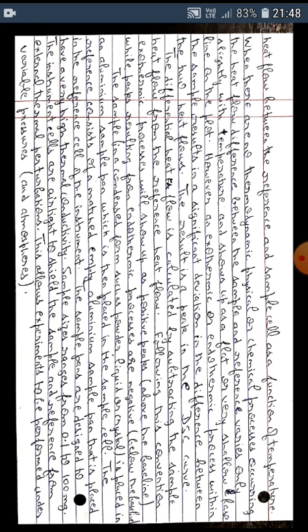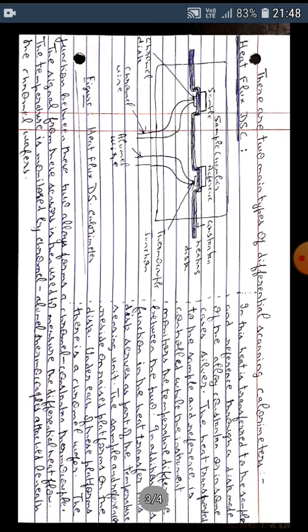The instrument cells are airtight to shield the sample and reference from external thermal perturbations. This allows the experiments to be performed under variable pressures. Now, there are two main types of differential scanning calorimeters. The first is known as the heat flux differential scanning calorimeter, which is shown in the figure.